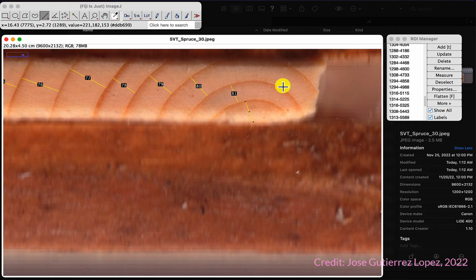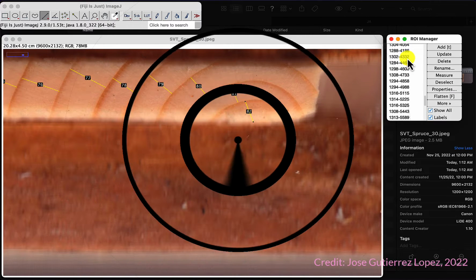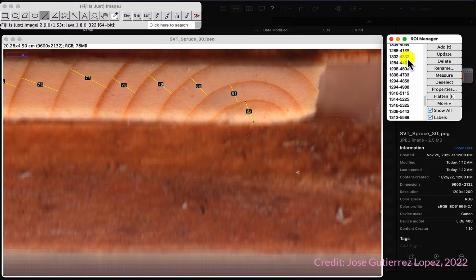Personally, if I don't see the other ring, I would just not. But in this case, let's just do that for this exercise. Okay. Took a while. 82 years old or 81 visible years. I think we are okay with this one.